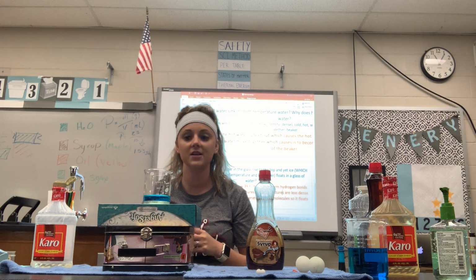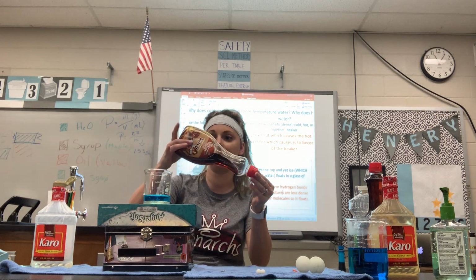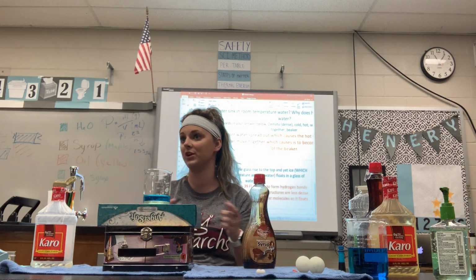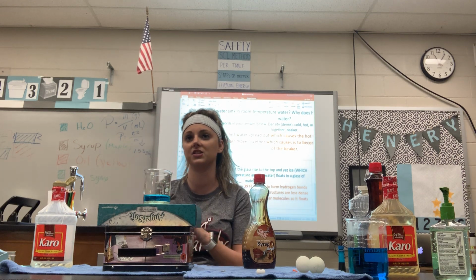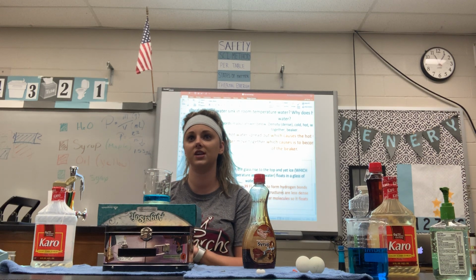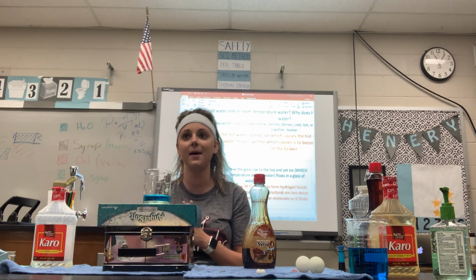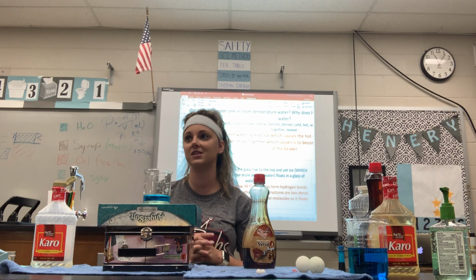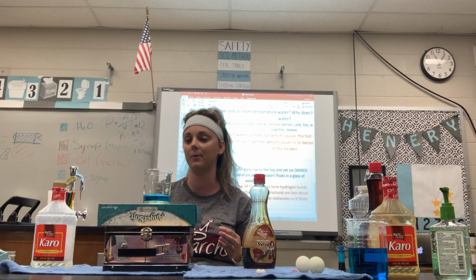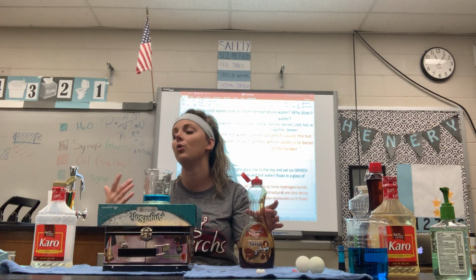Okay, now why is it important that, you know when you put syrup on pancakes, you place it over and you put a lot of pressure on it and it all comes out pretty strong? Why is it important that I don't do that when I'm putting it into the solution? Who can tell me why? What do you think? Yeah, they're going to start to mix. Is that my goal? No, my goal is not to have them completely mixed because then it's going to get rid of the experiment. So I'm going to very gently put this in here so you can see which layer it truly belongs to.